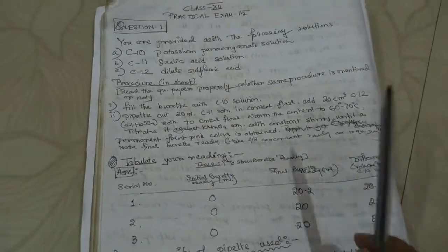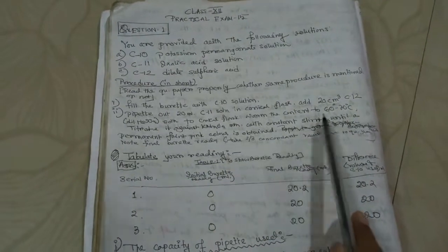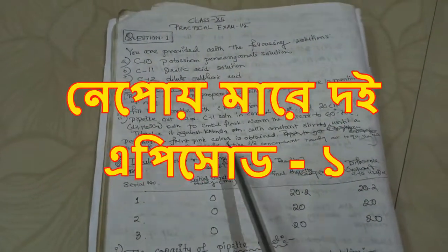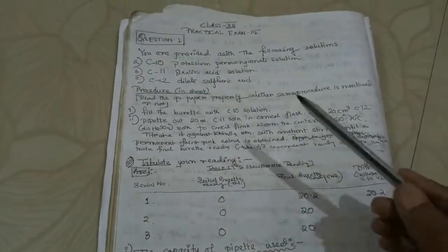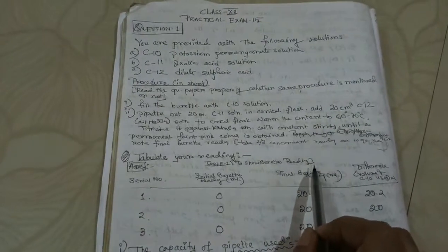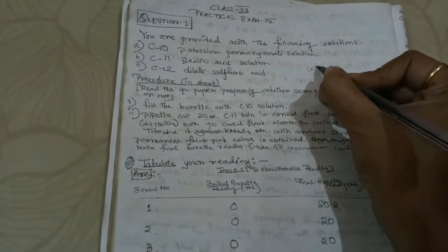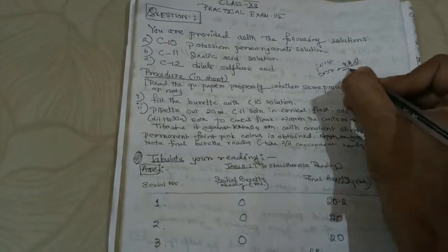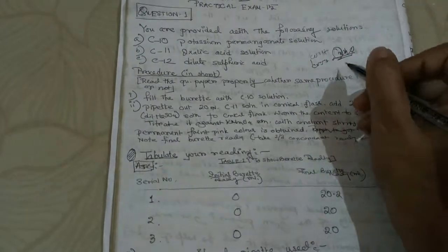This is the process as it was shown previous day. I hope you all have already written this one in the file. So experiment number 2, part 2 - today we will be doing calculation of the oxalic acid which is hydrated, that is C₂H₂O₄·XH₂O. You need to calculate the value of X as you did it for Mohr's salt case.